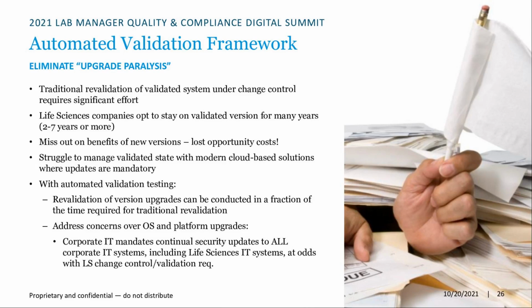The historical model was, we not only lock in a version of the application, but also a version of the operating system. And I got a lot of pushback at SGS when I had to push the corporate IT standard that we had to roll out security updates on a regular basis to our systems, and our quality people were saying, "Hey, we can't do it because these are validated systems; they're locked down." And so it was a real problem.